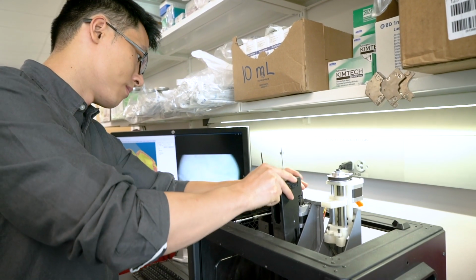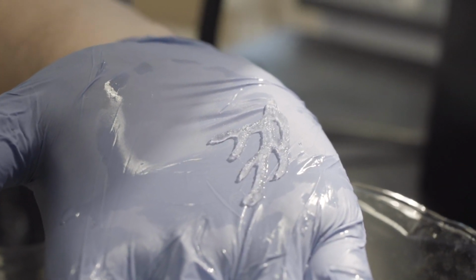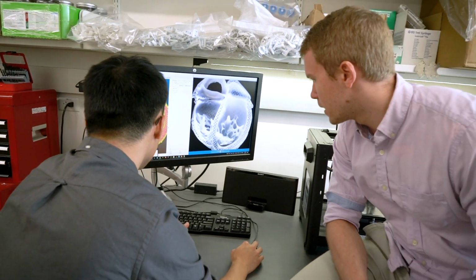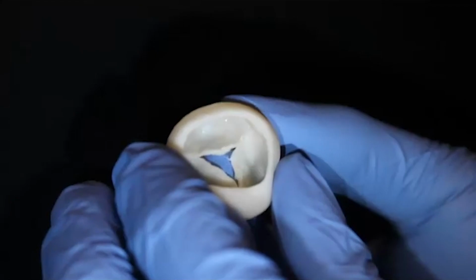So what we're really trying to accomplish with this paper is to really advance our FRESH 3D bioprinting technology that we published a few years ago, taking it from something that can create really cool looking structures that are really complex to really trying to achieve things that have true function. We've taken clinical imaging data, things like MRI, and we've used that to help design different scaffolds that represent different parts of the heart, things like heart valves, blood vessels, even contractile beating ventricles. And we've used that together with collagen and human stem cell derived cardiomyocytes to start to build functional pieces of tissue that contract, valves that open and close, and really multi-scale blood vessels.